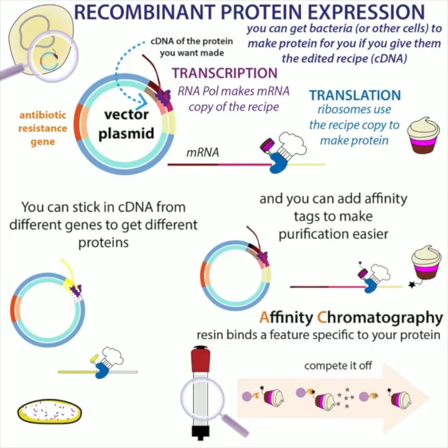So there are things that can happen after the actual physical expression that prevent you from being able to purify out the protein. And there are also problems with the purification itself, like if you use the wrong resin, or you accidentally wash your column with the competitor instead of the wash buffer, or the resin's gone bad, or that sort of thing. So there are lots of different places that things can go wrong.